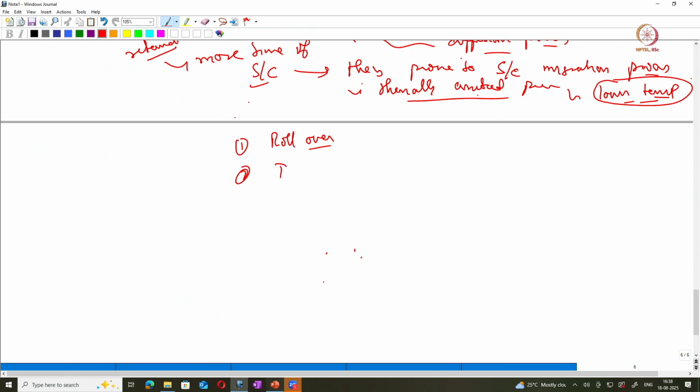The second is trajectory aberrations, which can be intrinsically related to the needle specimen and the distribution of field in the vicinity of the atom probe tip, and also to a difference in the evaporation field of precipitates and the matrix. So you will get different regions of atomic density on the detector, depending upon whether the precipitate evaporation field is lower or higher than the matrix.